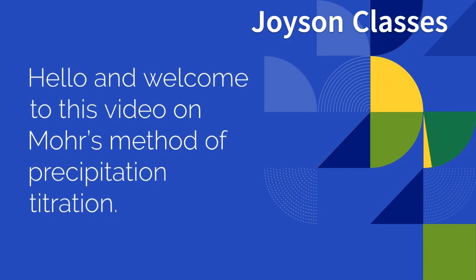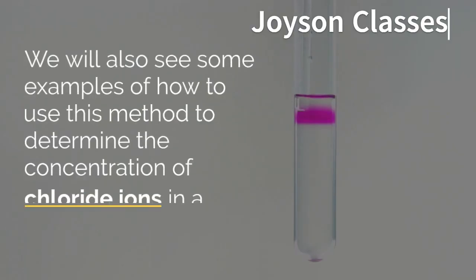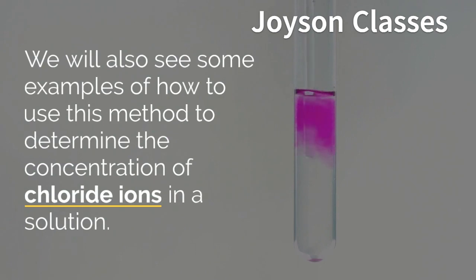In this video, we will learn about the principle, procedure, and calculations of this titration method. We will also see some examples of how to use this method to determine the concentration of chloride ions in a solution.